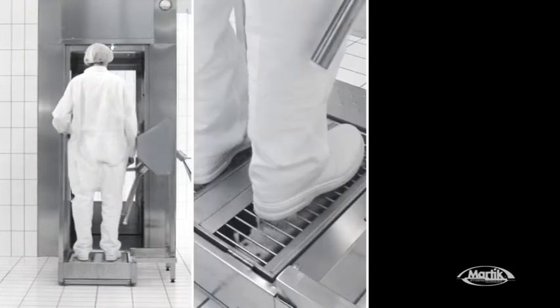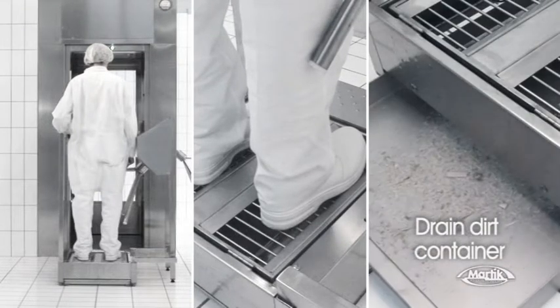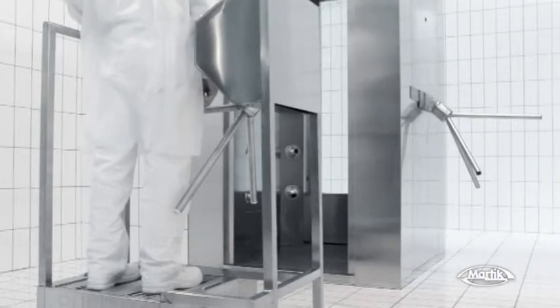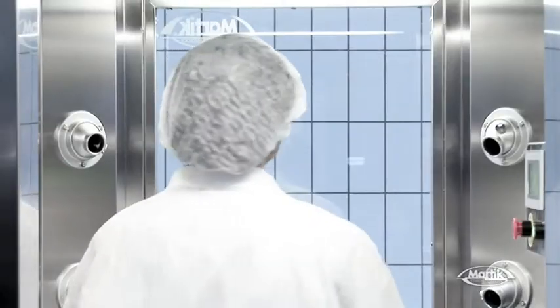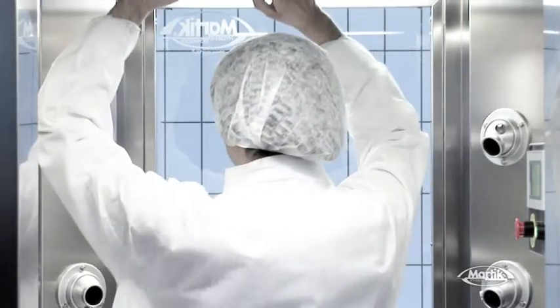Before entering the monitored germ-free division, you simply step on Pulley-Tek and your shoe soles are instantly brushed and disinfected. The dirt drains into a container embedded below the sanitizing passage. After the first cleaning, the three-arm turnstile is released, giving you access into Airtek. Right away, a photocell detects your presence and starts automatically the emission of decontaminated air.